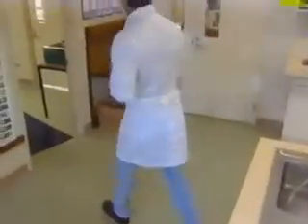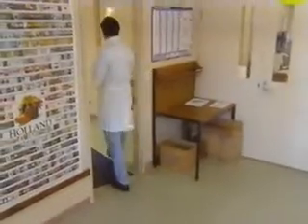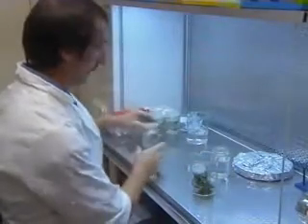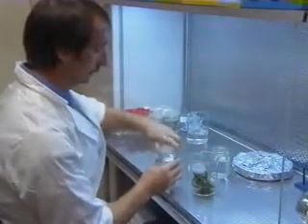Finally, everything is taken into the laminar flow cabinet, the hypochlorite solution is discarded, and the plant material is rinsed 2 to 3 times in sterile distilled water.